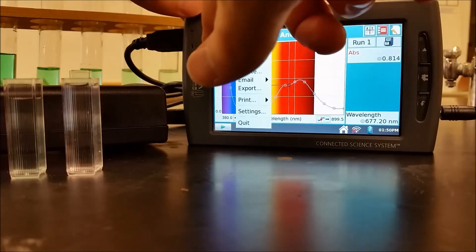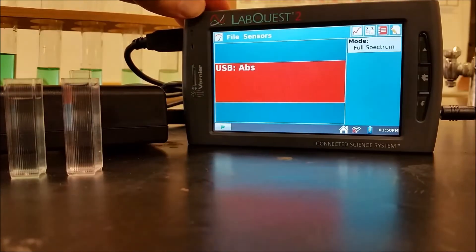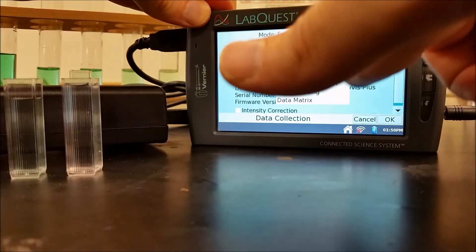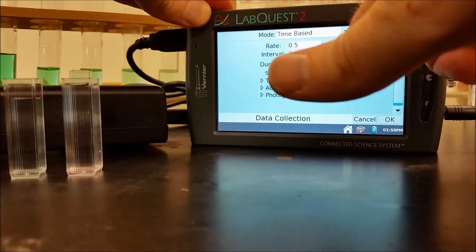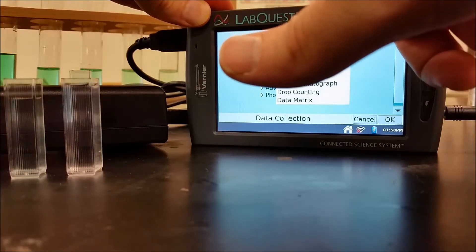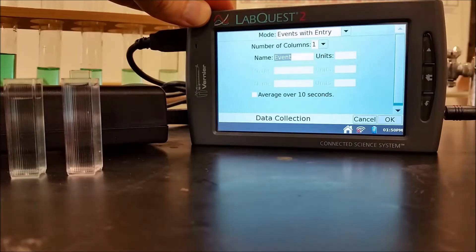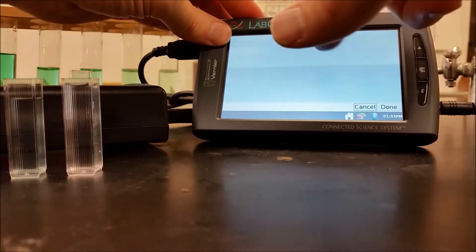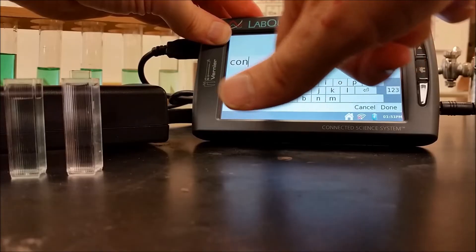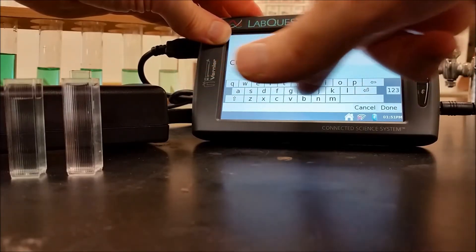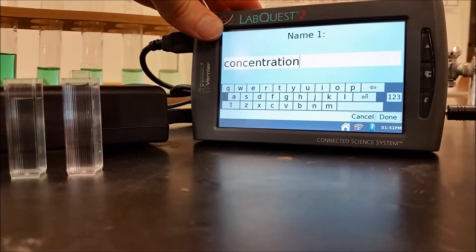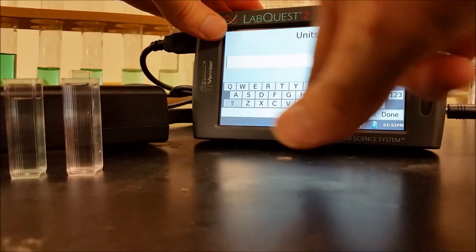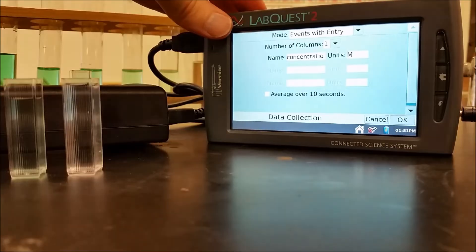So now what I want to do is go to this meter tab over here. And then I want to go from doing the full spectrum to doing events with entry. And so then I'm going to type in concentration with units of molarity. So there's concentration. I'll hit Done. And then for the units, I'm going to put molarity, just a capital M. And then I'm set.